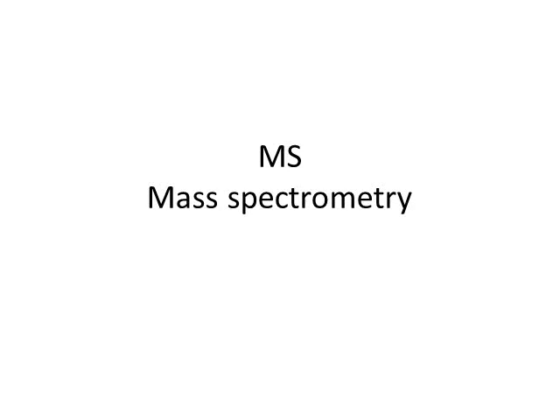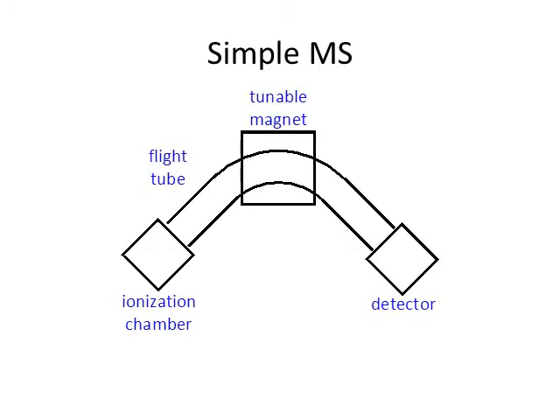But what is this different technique that I've alluded to, this different physical principle? In mass spectrometry, there's essentially four parts. There's something called an ionization chamber, there's a curved flight tube, there's a detector, and then at the corner, the elbow of that curved flight tube, there's a magnet. Let's start out by figuring out what each of these things is about, and then we'll see how these tell us about a molecule. Let's start with the ionization chamber.